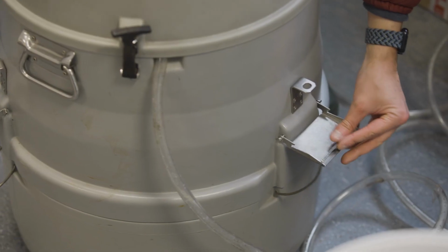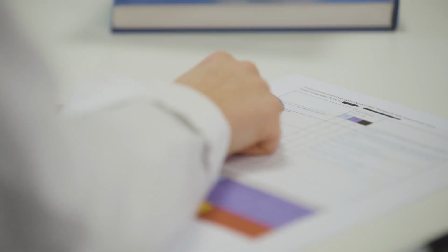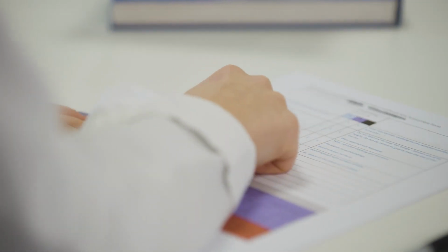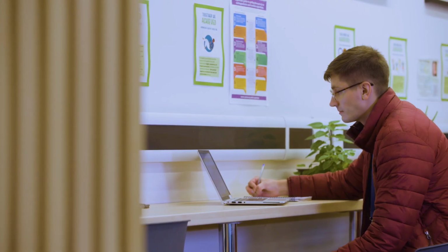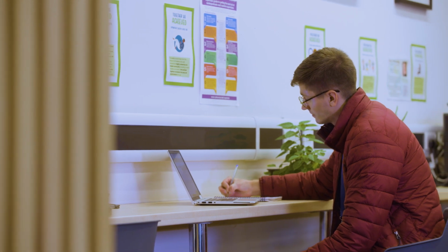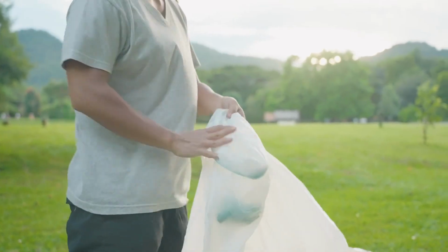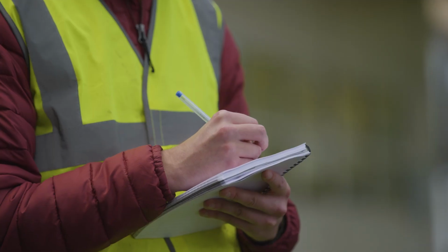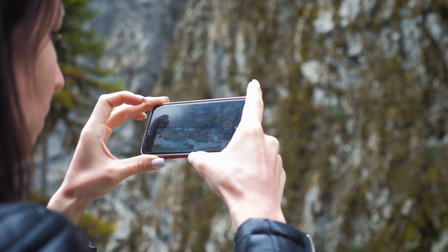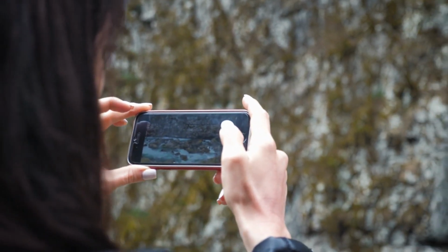Before heading out into the field, you must prepare all the equipment required for your chosen sampling method. Make sure to refer back to your risk assessment and health and safety documents and bring spare equipment if required. It can be a good idea to prepare a checklist and protocol to ensure sampling is carried out consistently. Wet wipes, tissue paper and a bin liner for waste are always useful as sampling can be messy. Take a field notebook to record any observations you make. A mobile phone or camera can also be useful for obtaining photographs of the site at the time of sampling.